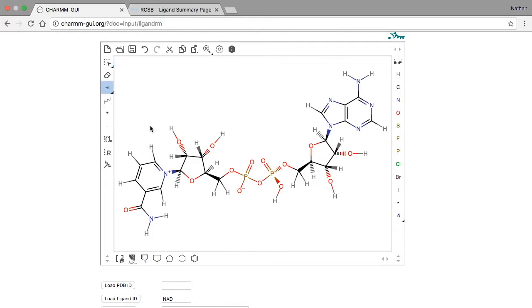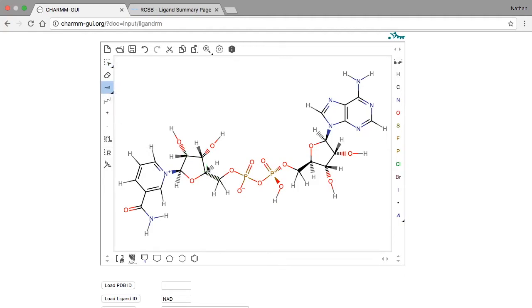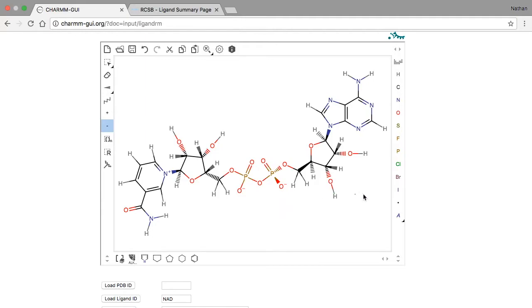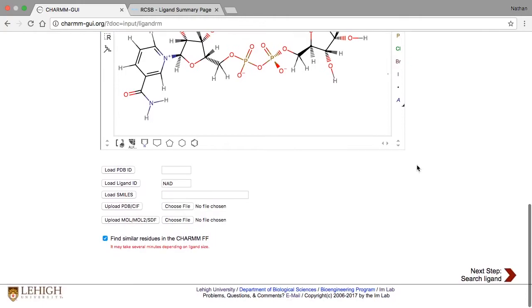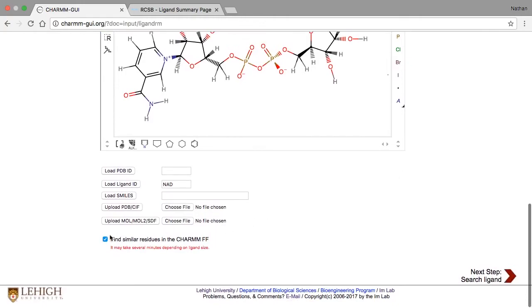To change the chirality of this atom, we need only to change the solid wedge to a dashed one and vice versa. We'll also remove this extra hydrogen atom so the structure is consistent with a physiological pH. Don't forget to change the oxygen atom's charge. When you're ready, deselect the option for finding similar residues, then click Next.